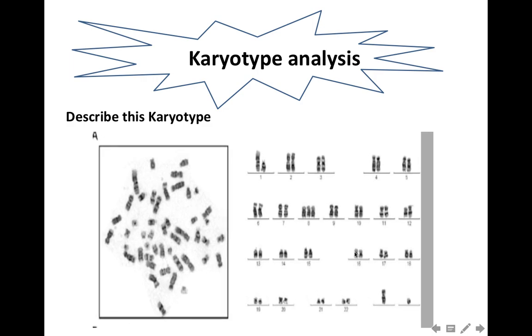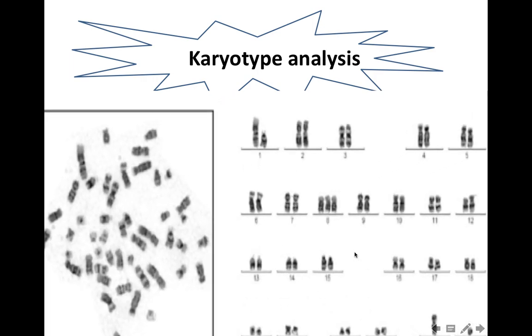Now we get a closer look at the karyotype and we compare each pair of the chromosomes. When you find a difference between the two homologous chromosomes, you look carefully for the type of structural change that is present. You can see here that the long arm is present, but most of the short arm of chromosome 1 is deleted.